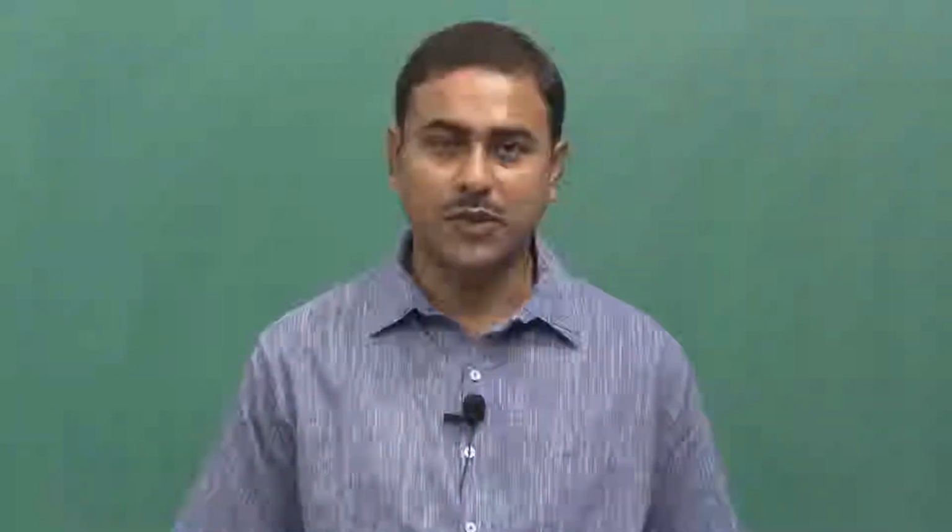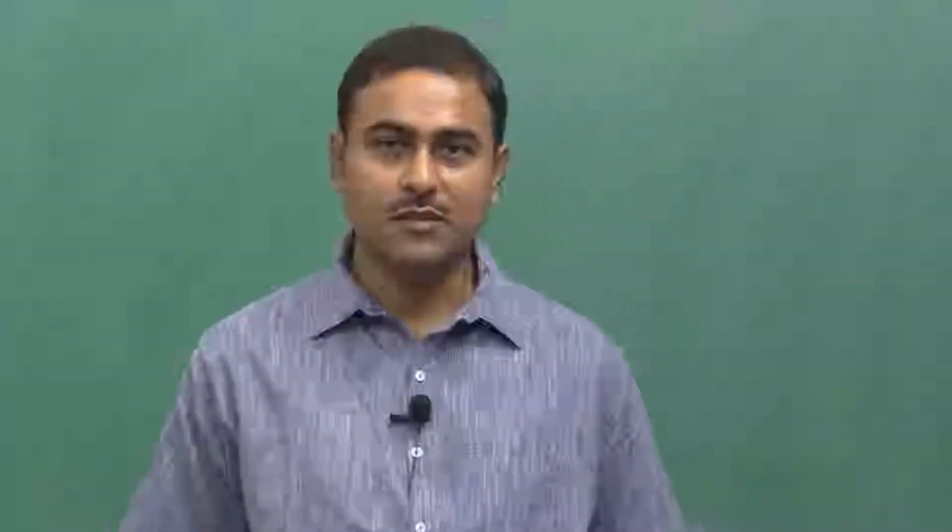Welcome to lecture number 40. In the last lecture, we discussed the total internal reflection geometry to achieve a very tiny observation volume, and we also started discussing this confocal geometry to create the small observation volume.